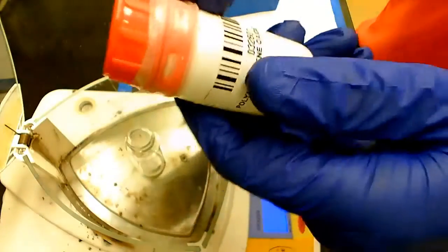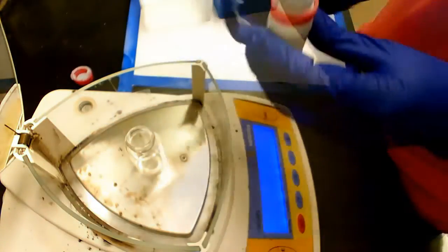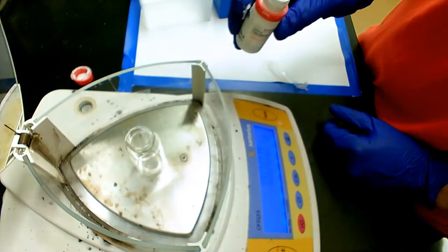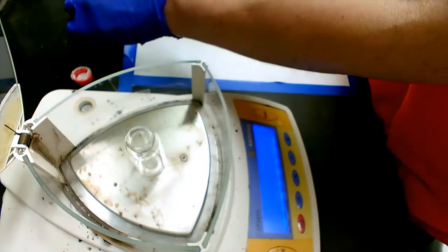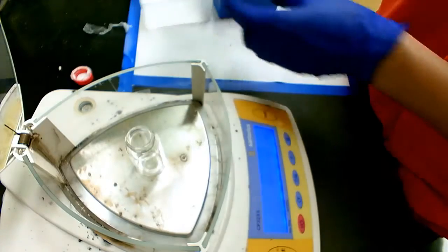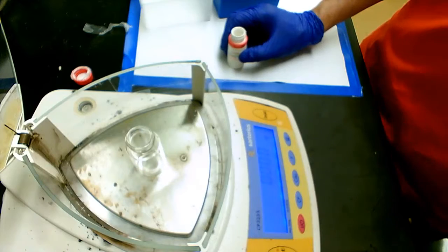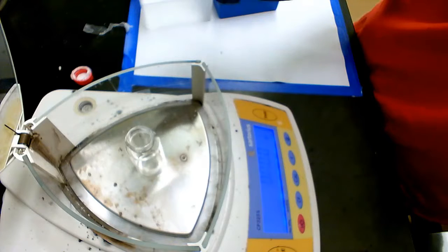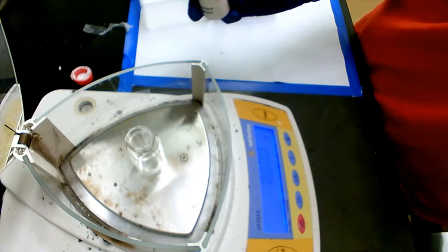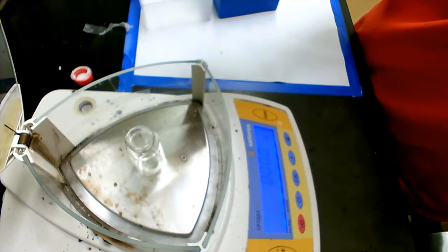Let's remove this wrap. Now I will get the calculated amount of PEO I need to make, for example, 10 milliliters of a 1% PEO solution. So 10 milliliters corresponds to 10 grams, and 1% means the amount of PEO we need to get a 1% solution is 0.1.